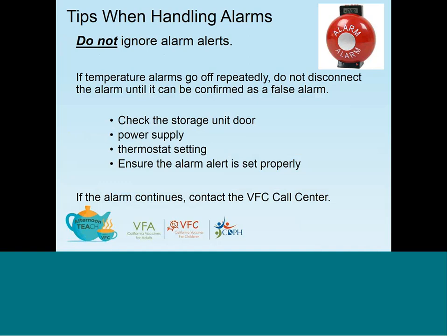We wanted to give you a couple of tips when dealing with alarms. The first tip we actually want to give you is please do not ignore the alarm alerts that you get on your device. If temperature alarms go off repeatedly, do not disconnect the alarm or the probe from the device until it can be confirmed that it is a false alarm.